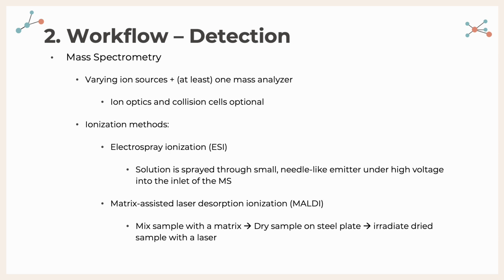And another thing to note is that MALDI, so the bottom one, is an independent or ambient technique. So this is able to be in situ rather than attached to the instrument itself, if that makes sense. You're able to essentially more easily bring it anywhere. It's more accessible, that's the word. It's more accessible, the MALDI ionization.